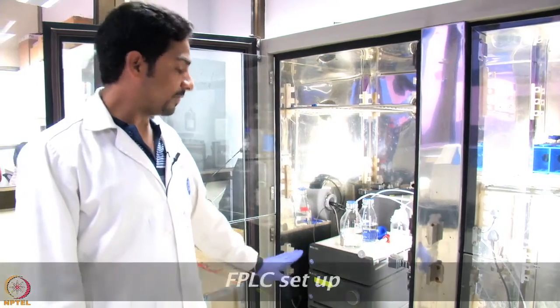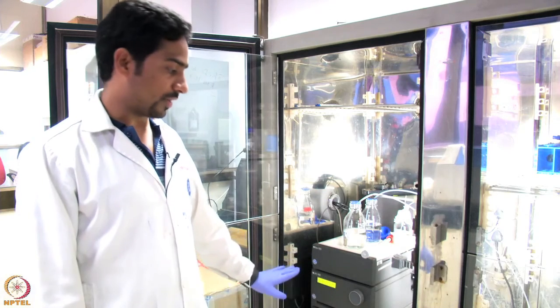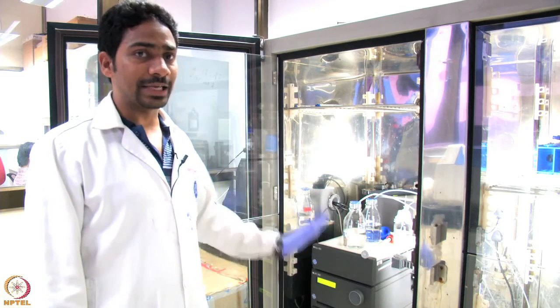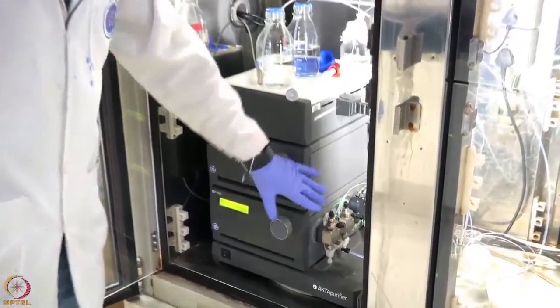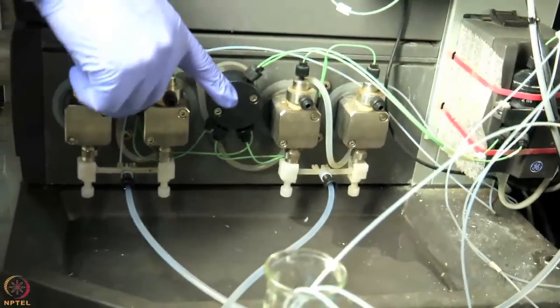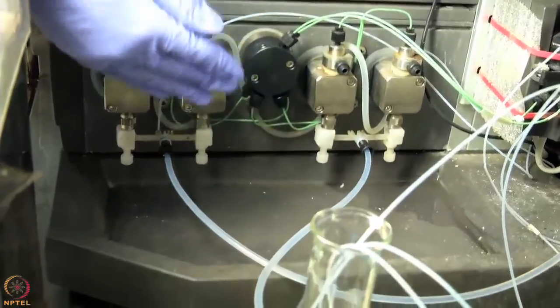So this is the FPLC system, fast protein liquid chromatography, where we can use different chromatography techniques and separate the protein by using this system. Here you can see some basic components of the FPLC system. There are two pumps, pump A and pump B. Each pump has a different buffer.